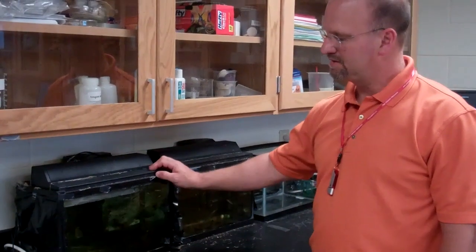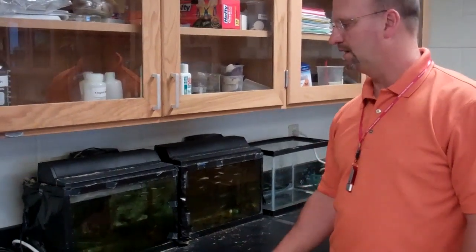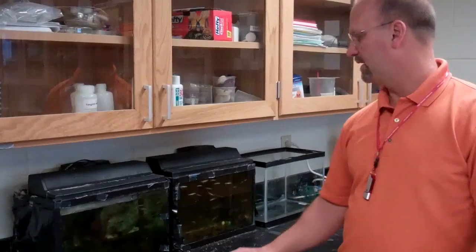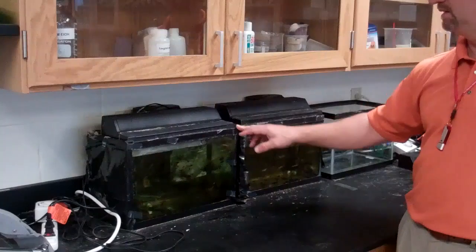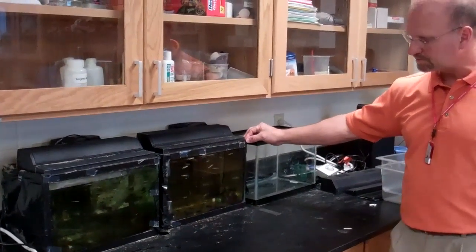My name is Mike Mullen, and this is a setup I have for my zebrafish breeding in my embryology unit as part of the SEPA program. Now what I have is 3 tanks set up. The first tank, I separated and put all the males in. The second tank, I separated out all the females.